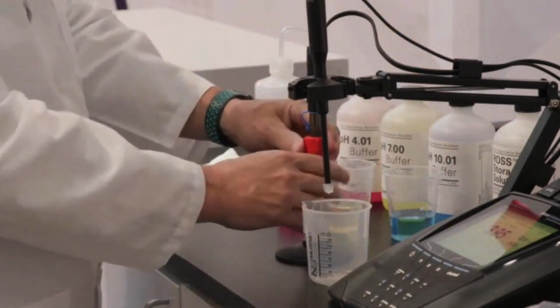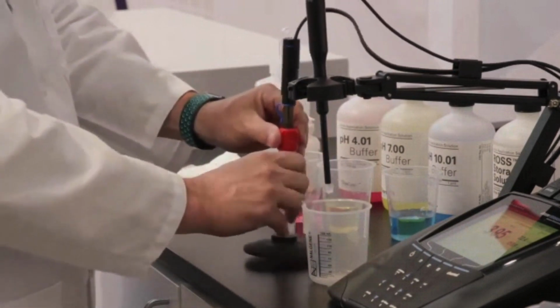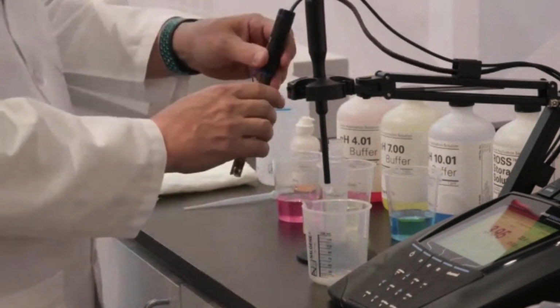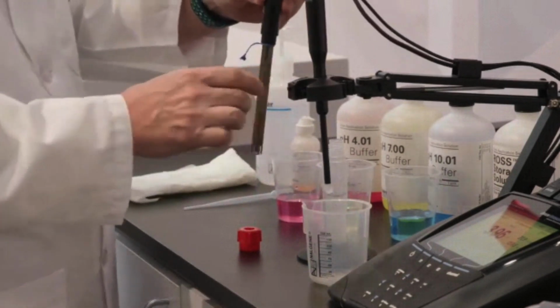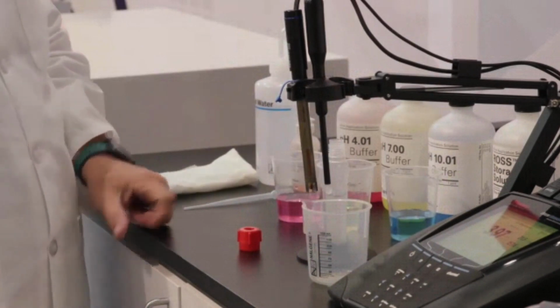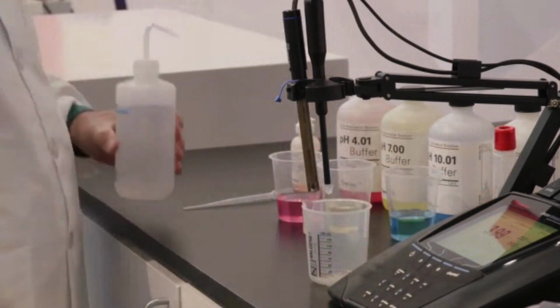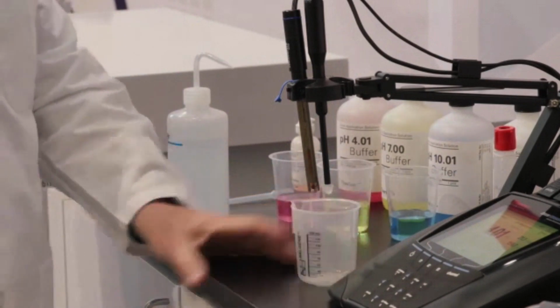So what we're going to do is first unscrew the storage bottle cap and remove the probe from the bottle. Now we can slide the cap off the electrode. This is especially good for low maintenance gel-filled electrodes. It will avoid creating a vacuum that can pull the gel out of the electrode when we're coming out of the storage bottle, and avoid pushing unwanted air bubbles into the gel around the junction when we're going back into the storage sleeve. Okay. So Steve has his electrode here.